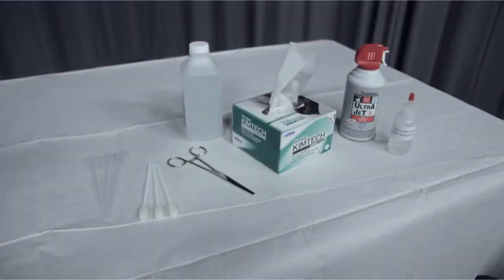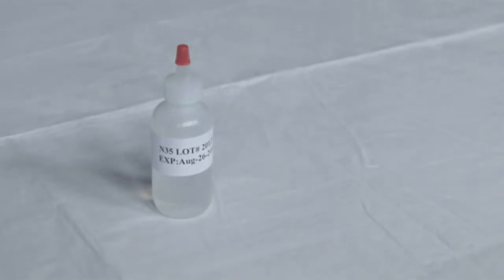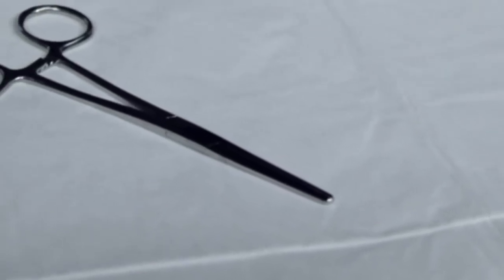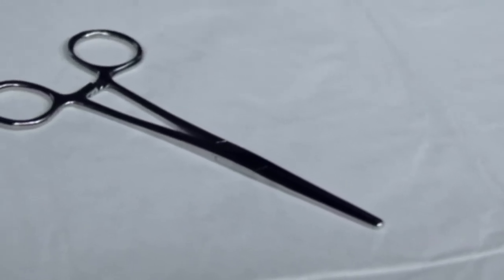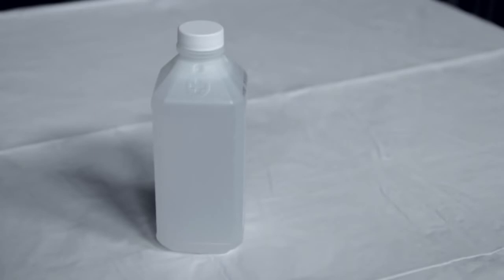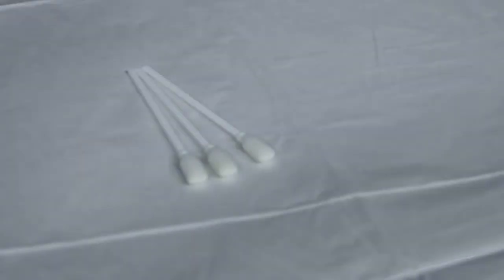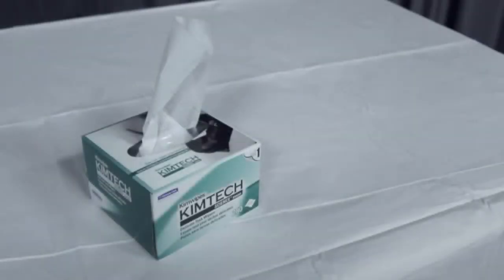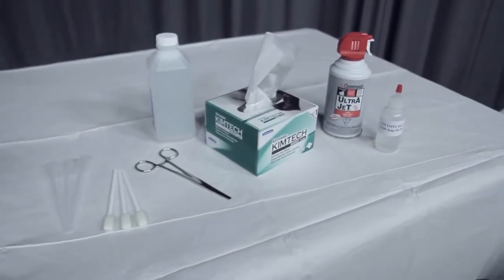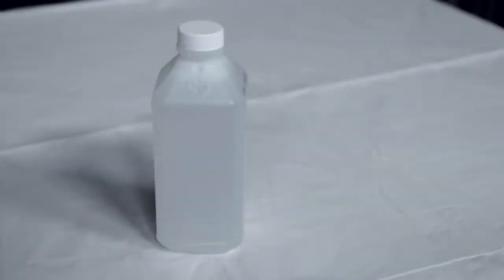You will need the following supplies to test the sample: a sample, a pipette, the forceps provided in the accessory kit — please avoid needle nose pliers that gouge the stainless steel surface of the measurement chamber — a charged canister of clean gas for blowing the sensor out, a solvent (in this video we are using isopropanol alcohol), foam tipped swabs, and lint free tissues. These supplies are all included in the VSCOLAB accessories kit except for the sample, gas, and solvent.